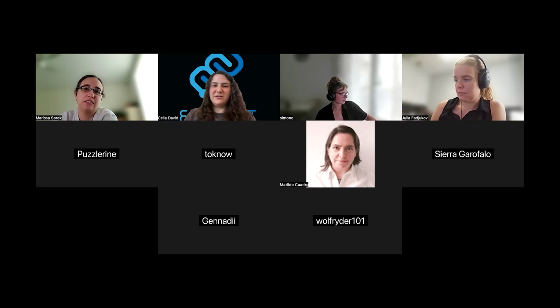There will be more training doing this annotation project, and by the time we get to proofreading, we have people who have already been trained and we trust them to make correct branches, or connections, for the most part.